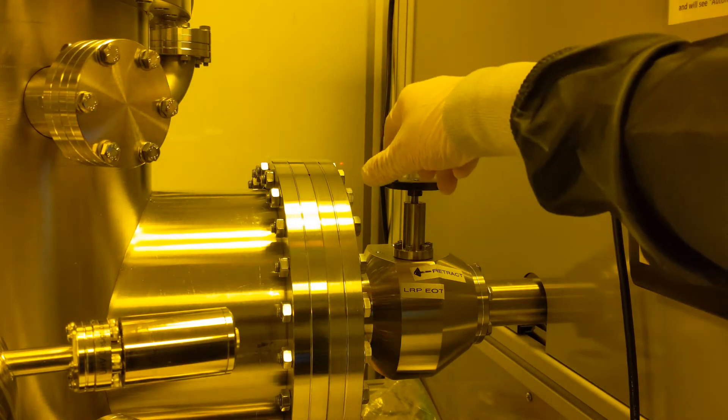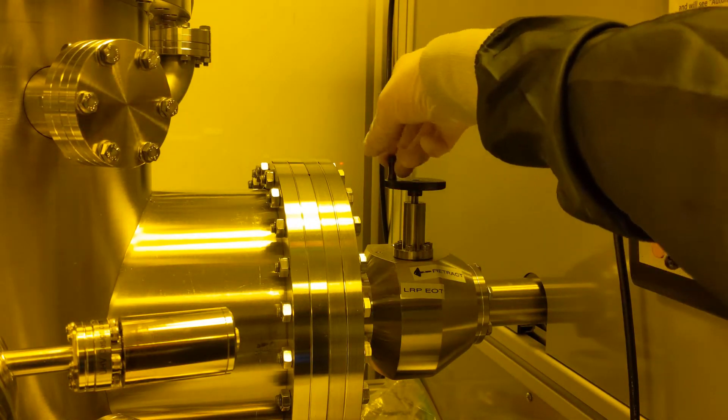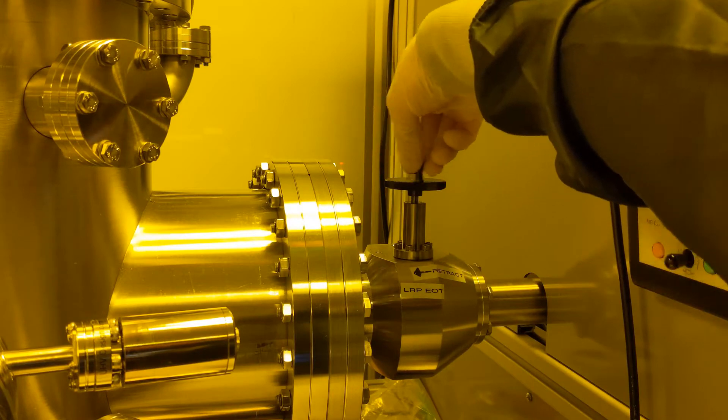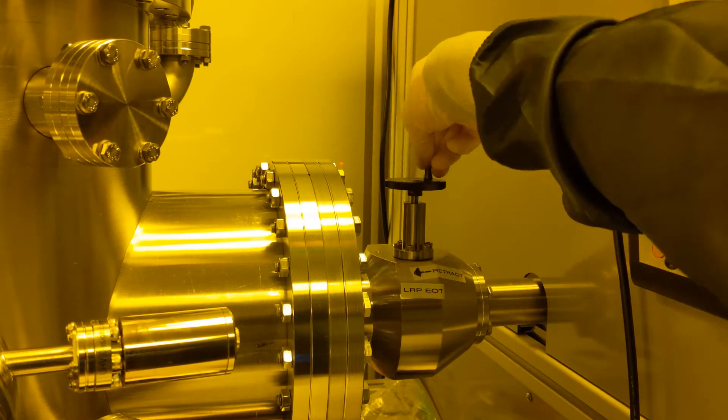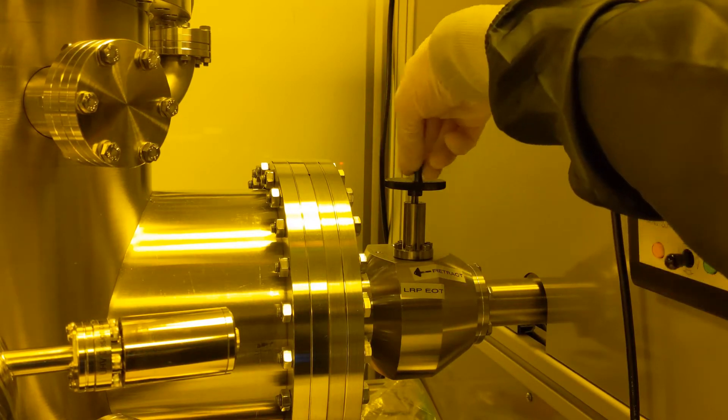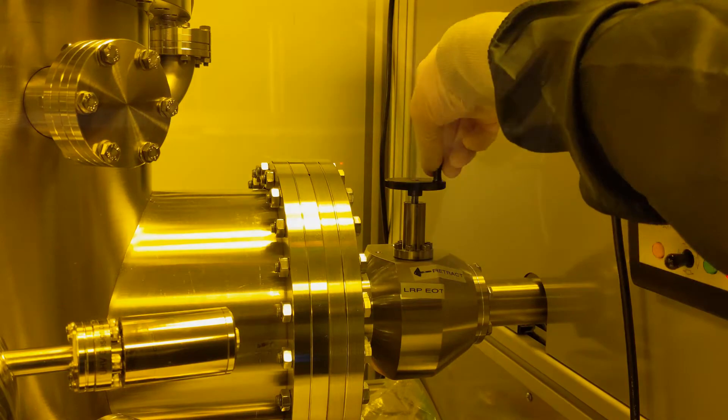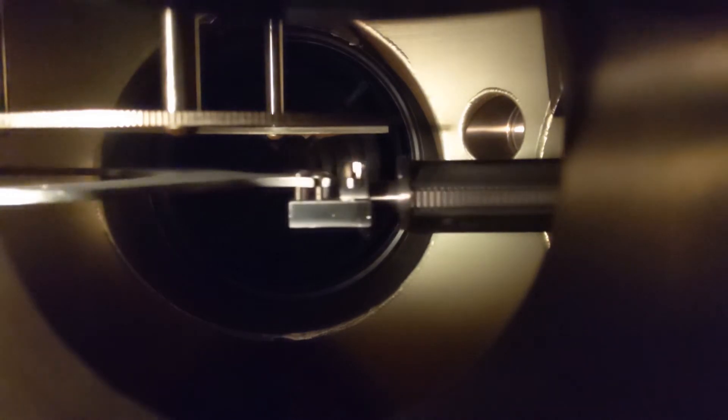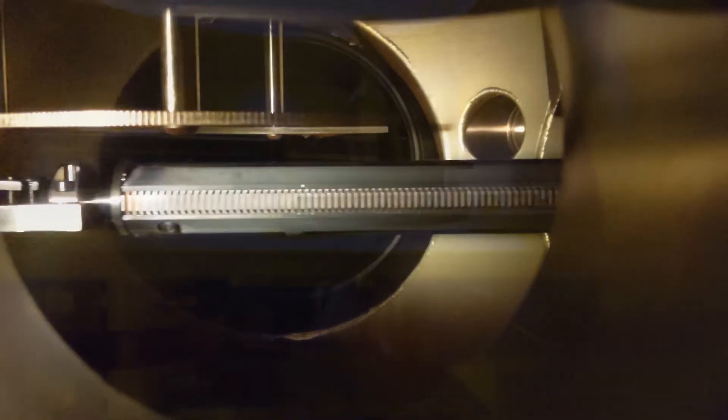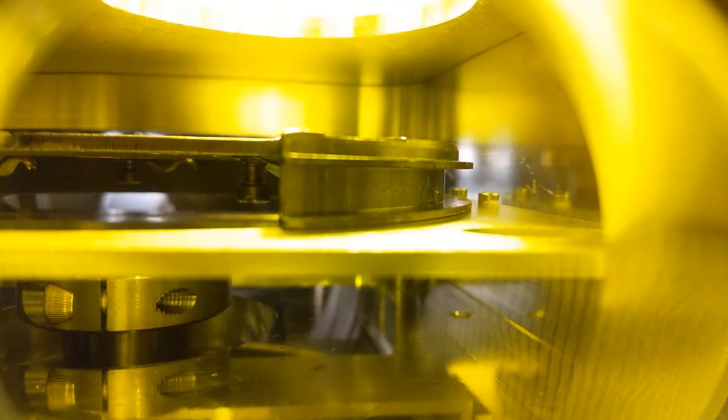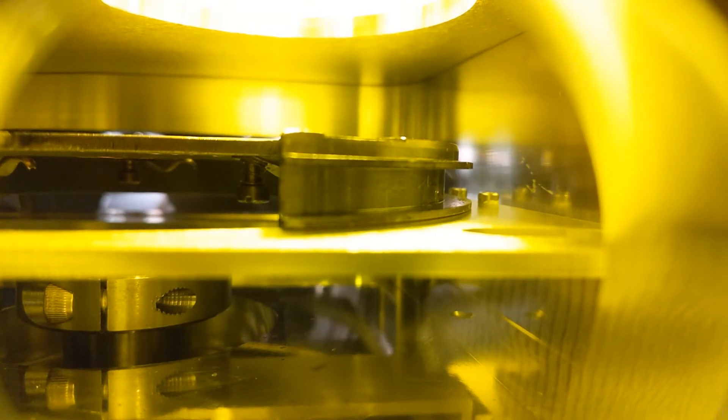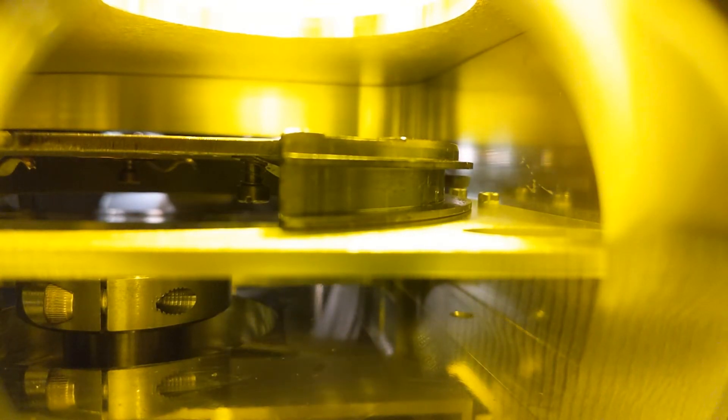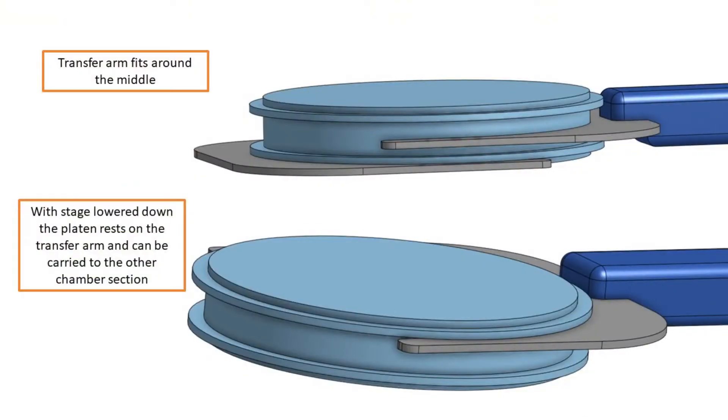Then use the transfer arm wheel to move it into the load lock. This is a view you can get by looking through the small viewport on the side of the load lock. Here we are bringing the transfer arm in until we feel it reach a hard stop.